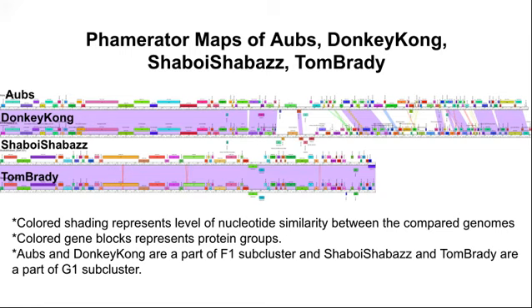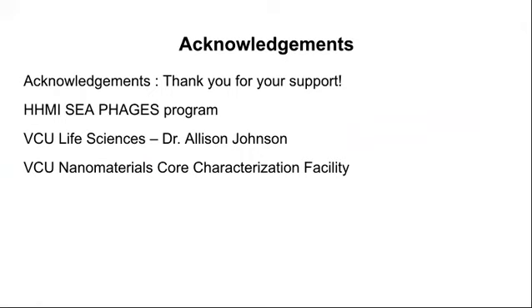Combined, we have learned after the phage's discovery how to correctly sequence, annotate, and the fundamentals of these processes associated with our collection, specifically learning about the nucleotide sequence and proteins in comparison with other phages, various types of proteins and their functions in our phages, identifying coding potential, and much more.